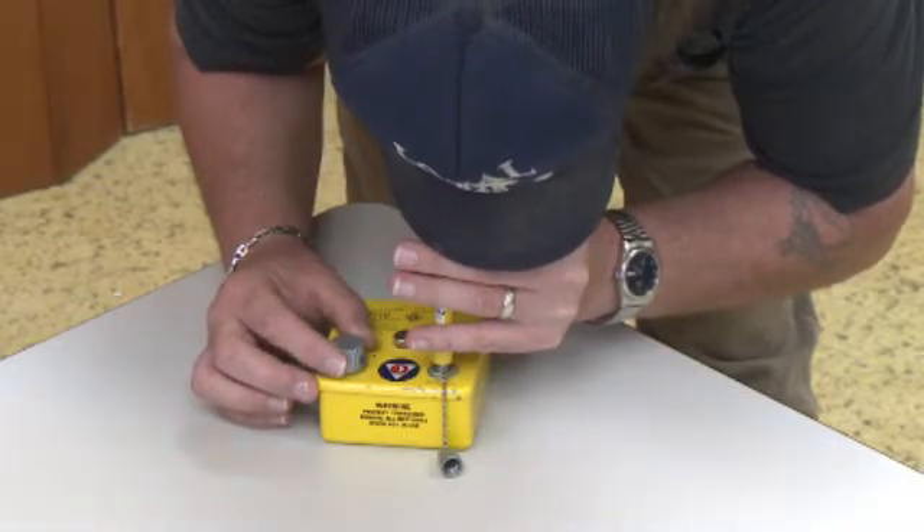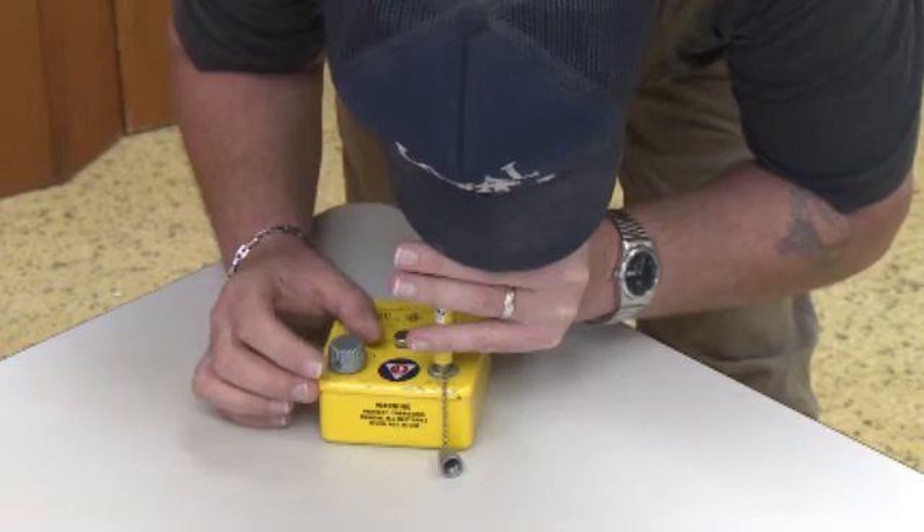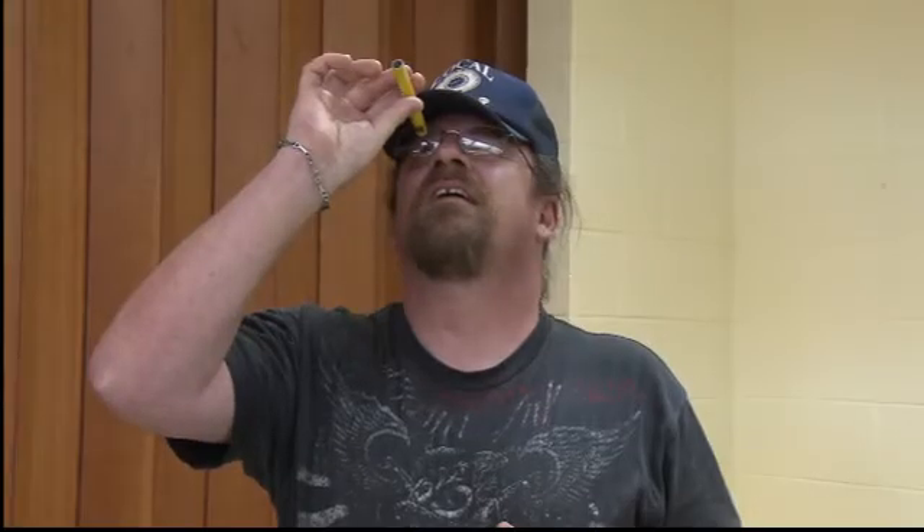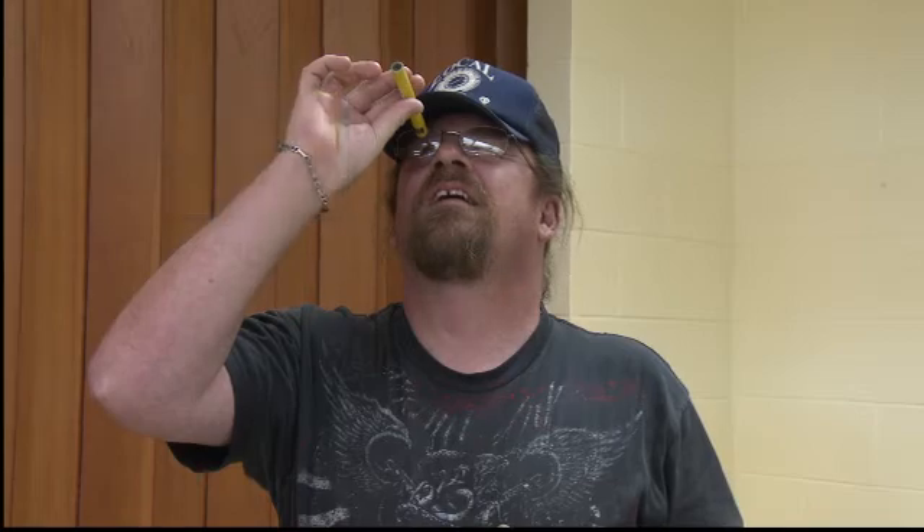Release the dosimeter, allowing it to rest under its own weight on the pedestal for a moment. Then look through the eyepiece toward the light. If the line has drifted upscale or is off to zero position, repeat the procedure. Good to go.